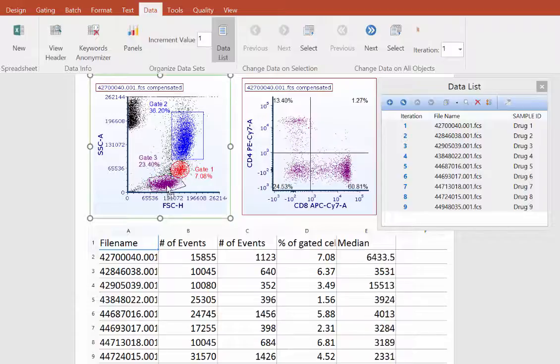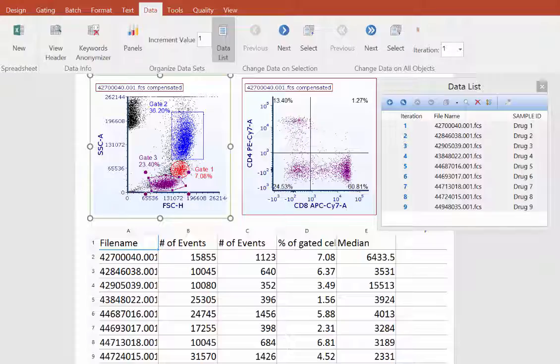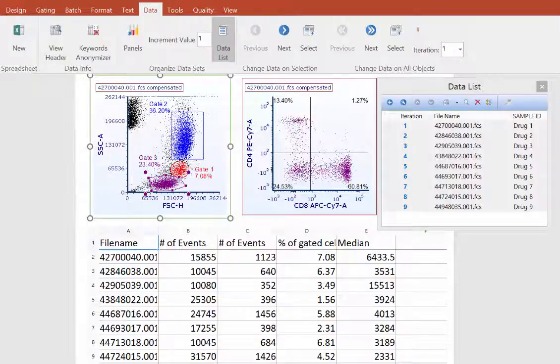Spreadsheets are a powerful tool for comparing multiple statistics from all the data files in the data list without opening additional plots.